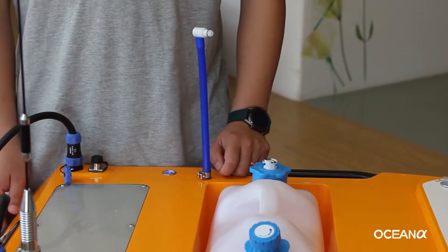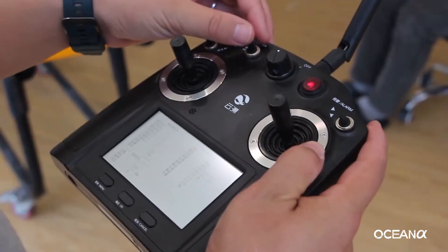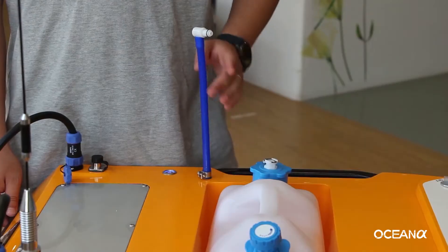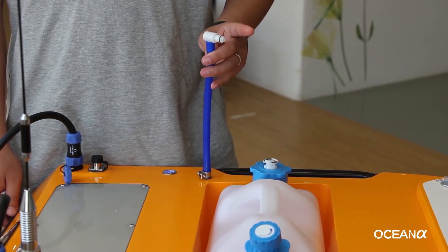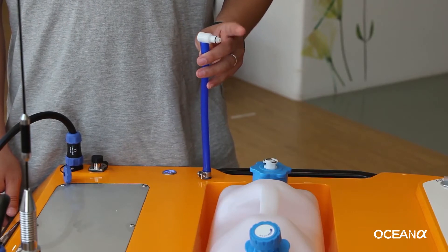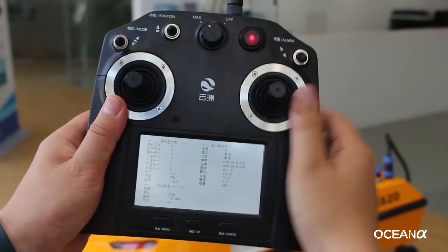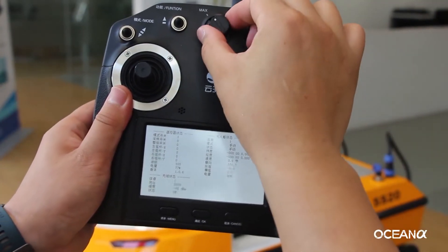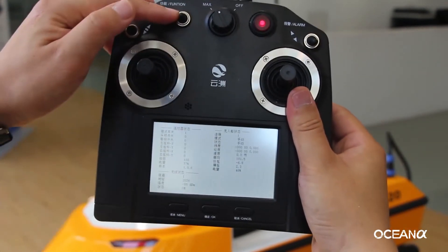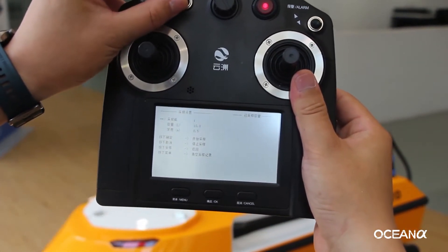Next is the sampling test. Push the sampling button — the sampling tube will be lowered. Block the inlet tube with your finger. If there is air blowing out, that means the sampling function is working. Rotate the speed knob to adjust the acceleration speed. You can choose your sampling amount with the joystick.